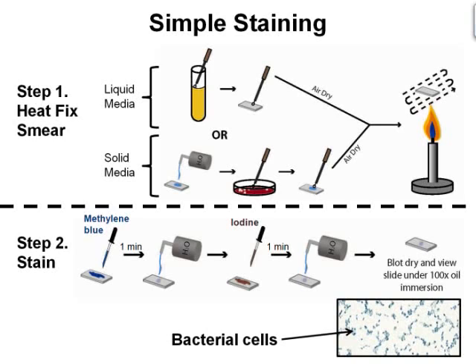Saturate the smear again, but this time with iodine. This will set the stain. Wash off any excess iodine. Blot the slide using bibulous paper. It is important not to rub the slide, rather place the slide between 2 sheets of bibulous paper and press down gently. This will preserve the organisms on the slide and the paper will absorb any excess dyes.